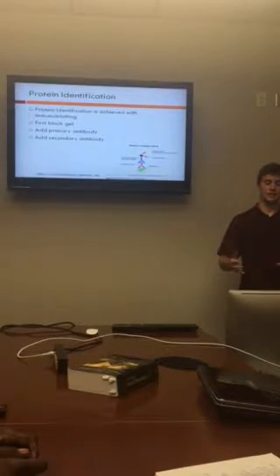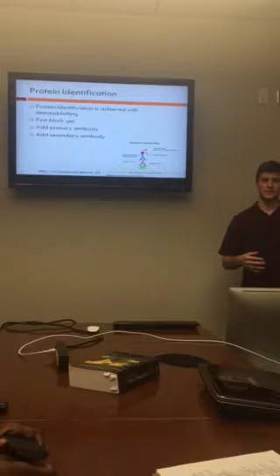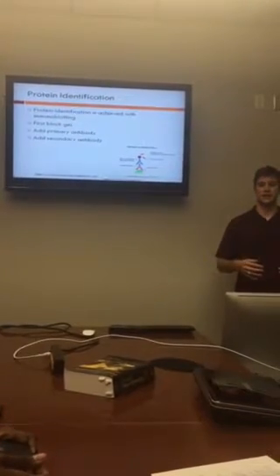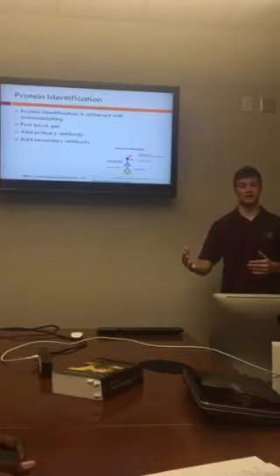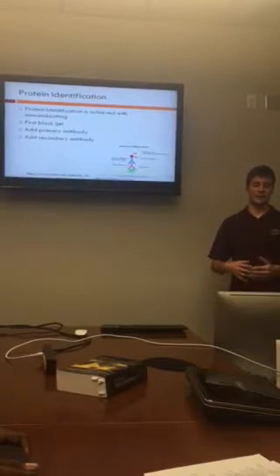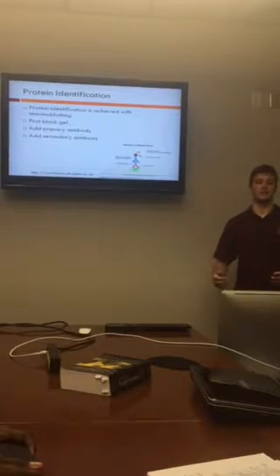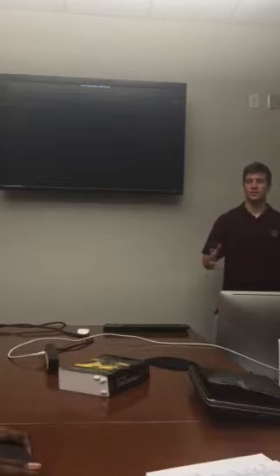After blocking, we add a primary antibody, and this is an antibody specific for the protein of interest. And then we add a secondary antibody, and the secondary antibody is generally conjugated to something that will allow you to visualize this. It could be an enzyme, or it could be a fluorescent probe. But the secondary antibody is specific for your first antibody, so this is how you're going to get your output. And that's how you do a Western blot.